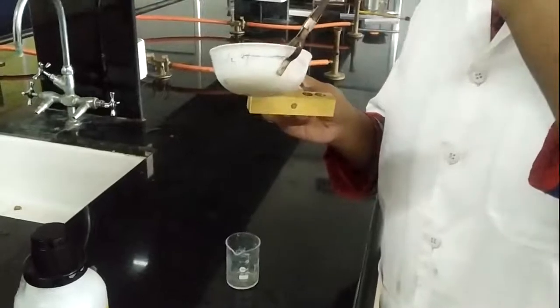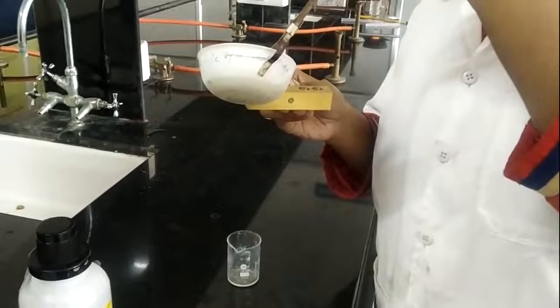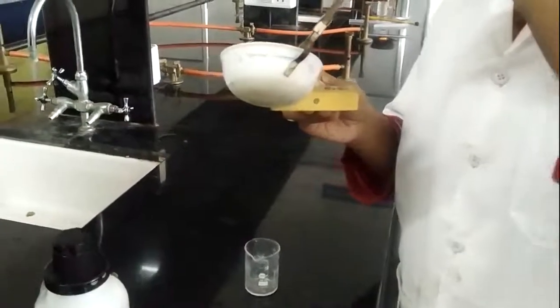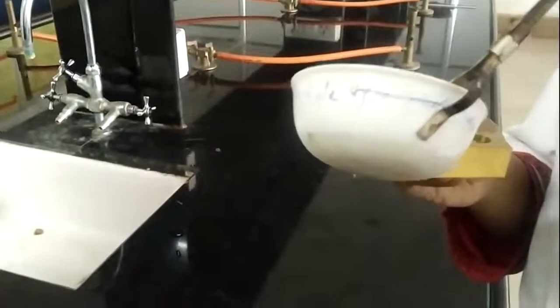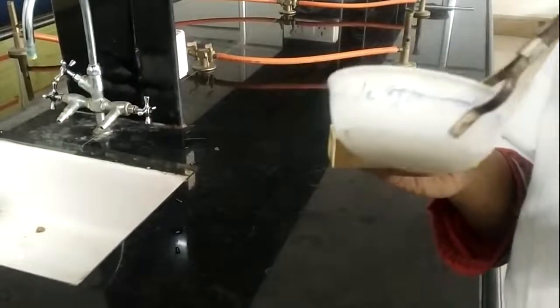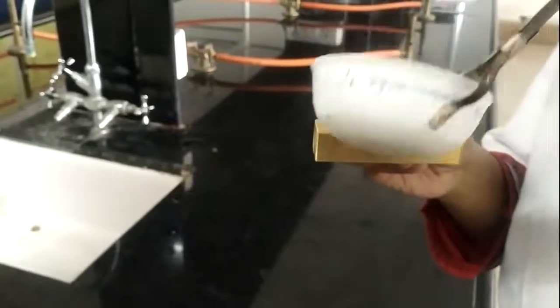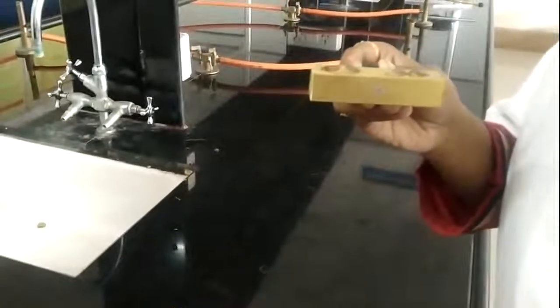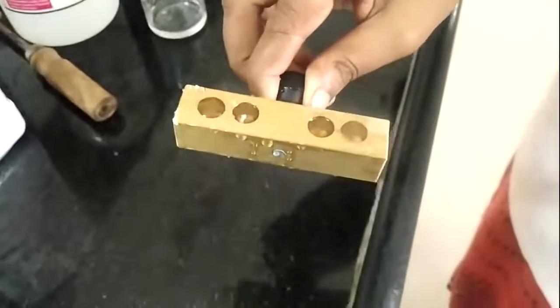I am going to fill all 4 cavities of this mold and overfill it. Let's see, I overfilled this mold.